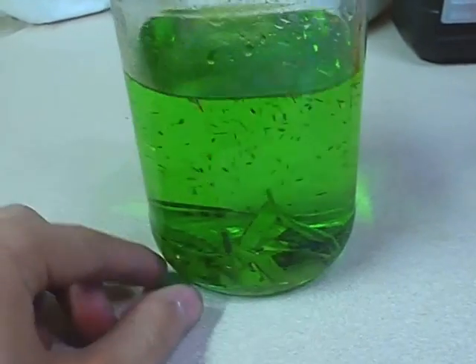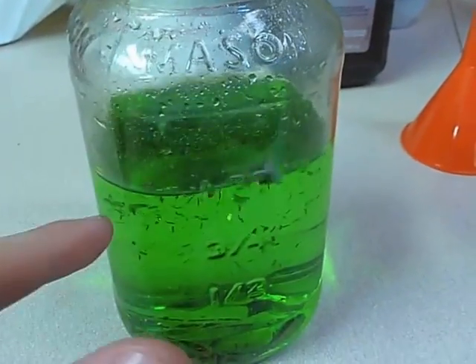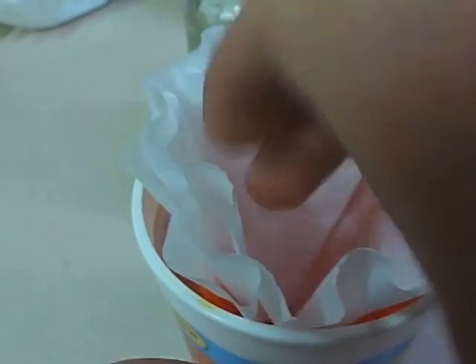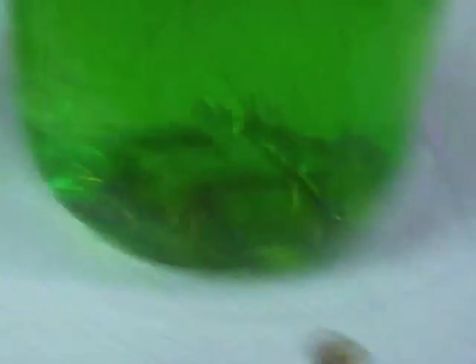Now that most, if not all, of the foils are off of the printed circuit boards and floating in the green solution, we're going to filter the solution through some coffee filters in this funnel. I have the filter in the funnel in the cup, and we're going to pour the solution into it. It does take a little bit of time to drain down, and we're probably going to have to use more than one filter because it's going to get saturated. Make sure the pieces of gold are all in the fluid and not resting on the bottom.